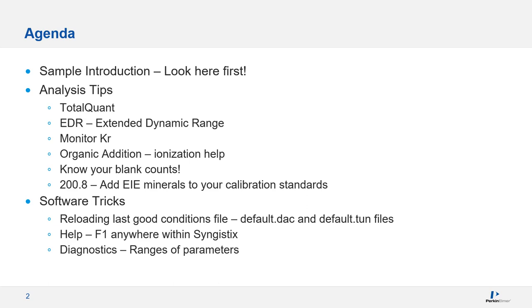Our agenda for this talk includes looking more in-depth at potential issues with your sample introduction system, as most issues occur here. We'll also delve into a few analytical tips, like total quant analysis for screening purposes, EDR or extended dynamic range, parameters to monitor in your analysis, as well as a few software tricks you may have forgotten or don't use that often.